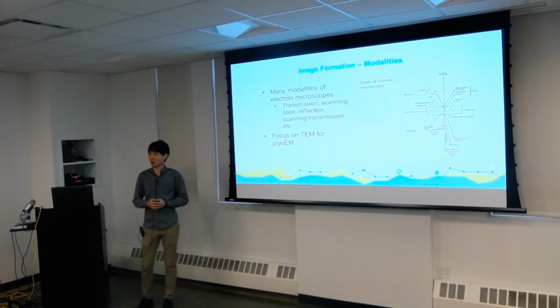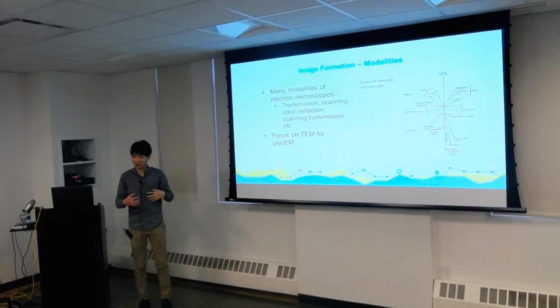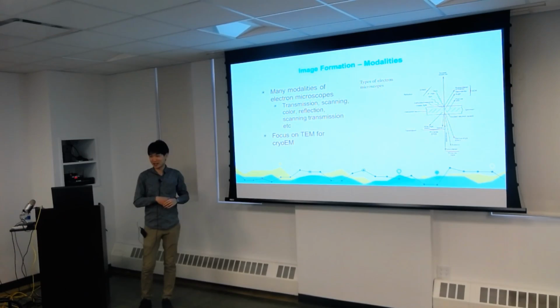And you can also do many things like transmission, scanning, reflection, and even, like you mentioned, the conductance of electrons flowing in, you can observe that and use that to determine what's in a sample. So that's pretty cool. But for our workshop, we'll just be focusing on TEM for cryo-EM. So the transmission part, as you can see, the electrons just go right through.